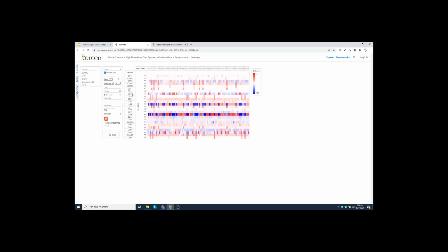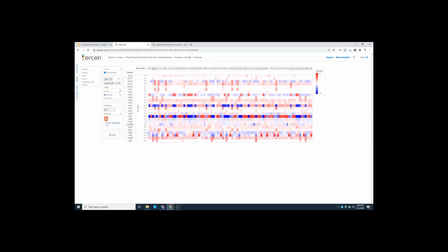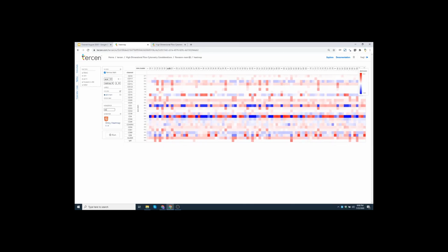So now you see per marker, you have the 90 clusters on the columns. For each cluster, you have this list of MEM scores for all the markers, where red would be enriched and blue would be depleted, from plus to minus 10. White means there's not much change compared to how the other clusters are doing. It's not moving very much. It's not enriched or depleted.